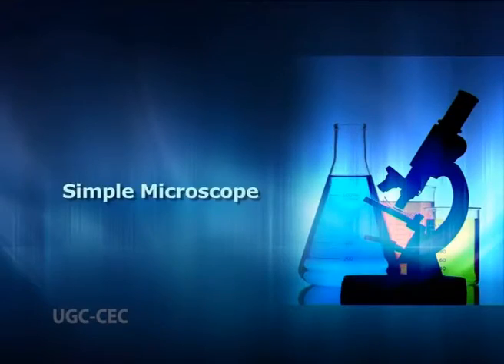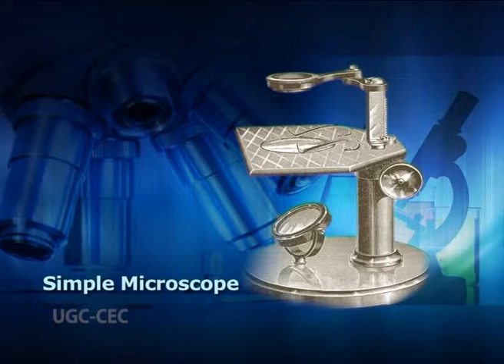Simple microscope. A simple microscope or single lens microscope uses just one lens for magnification of the sample. It is the original light microscope that is now considered primitive. It uses a single convex lens that is commonly observed in a loupe. It is generally used for gross or whole mount of small organisms or tissue sections.